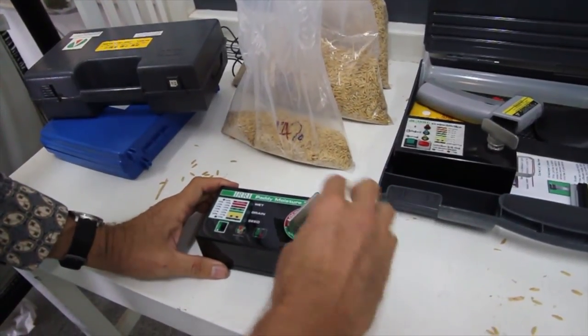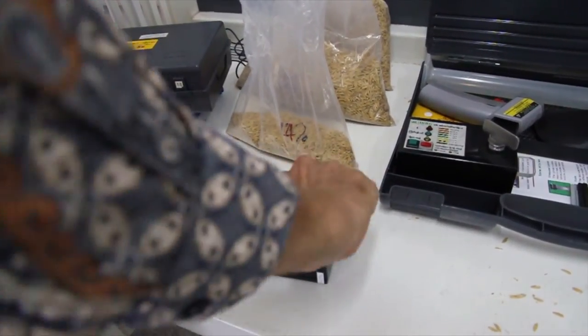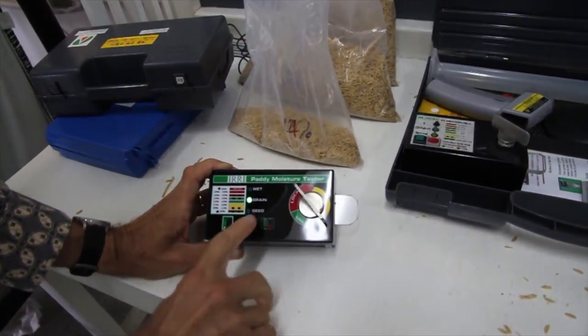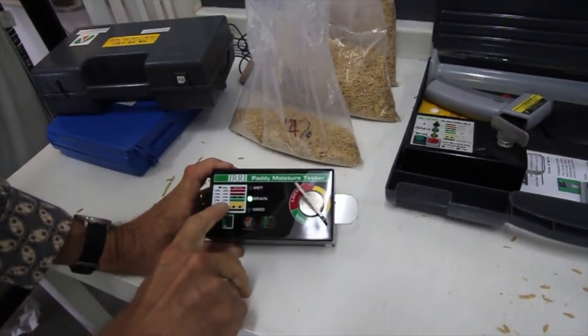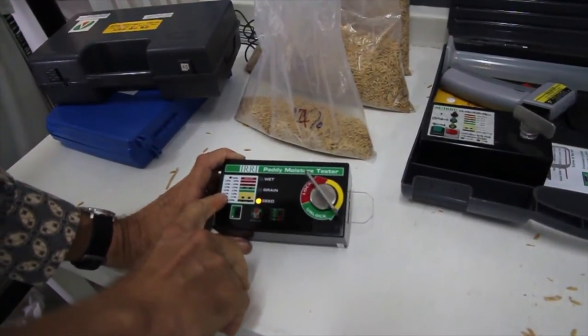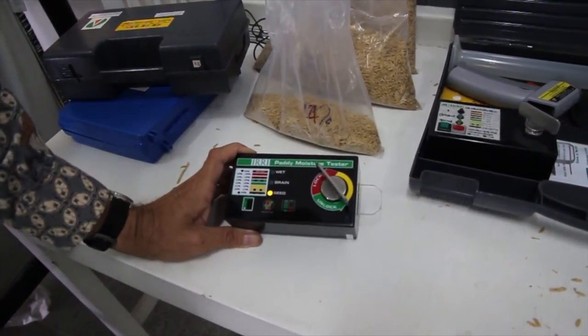We do the same process. Green means it's dry enough for safe storage, and green permanently on means that it has between 12% and 13% moisture content.